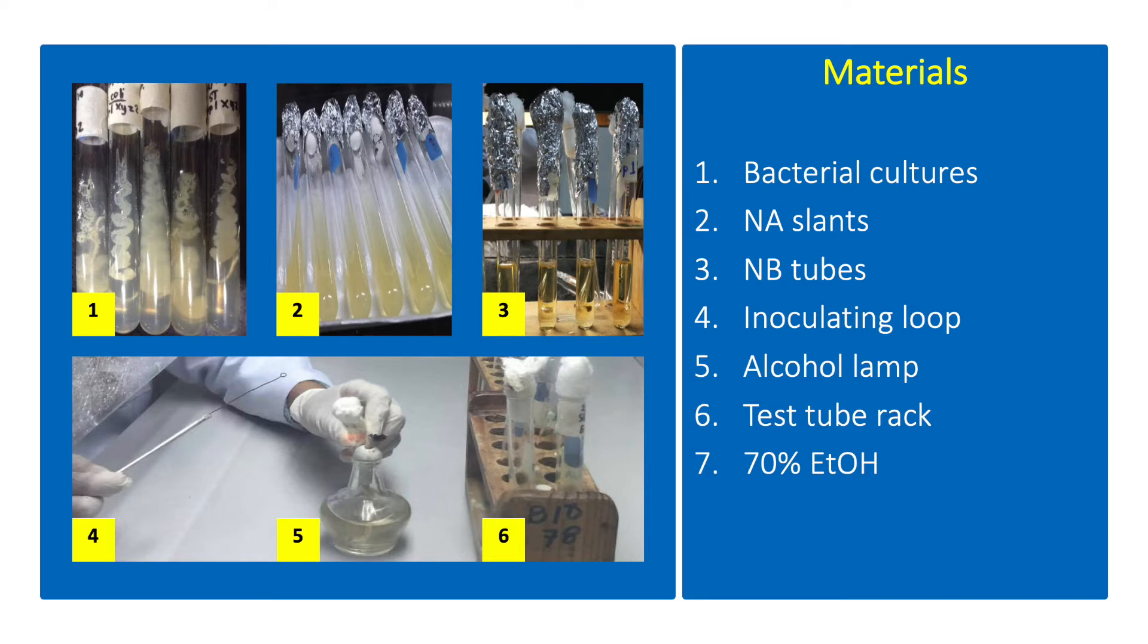Bacterial cultures Escherichia coli and Bacillus subtilis, nutrient agar slants, nutrient broth tubes, inoculating loop, alcohol lamp, test tube rack, and 70% ethanol.